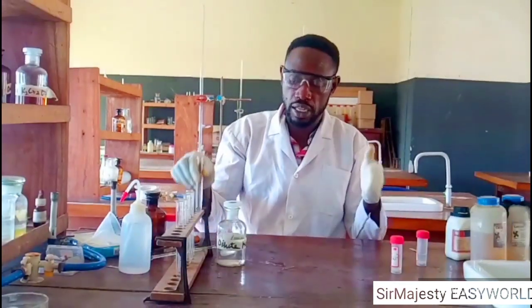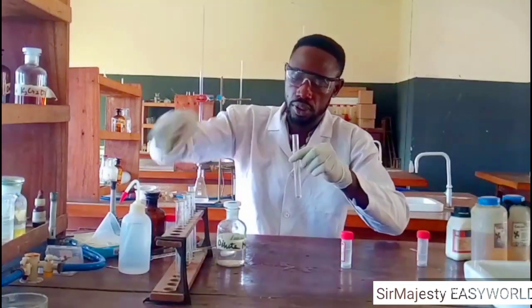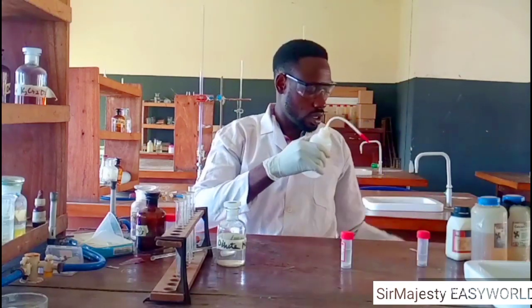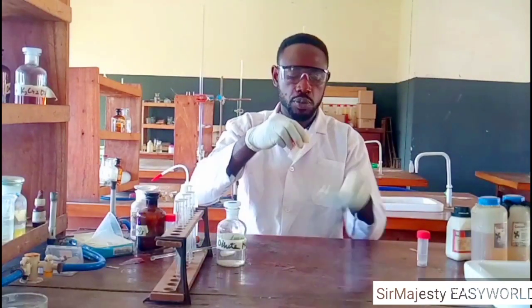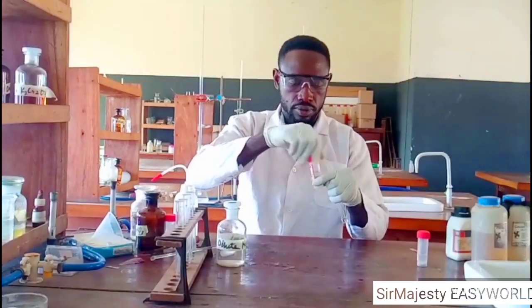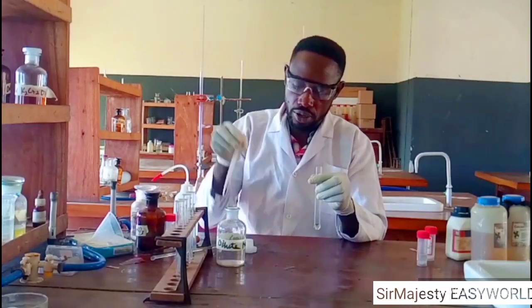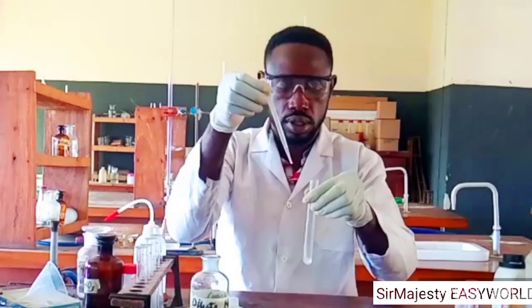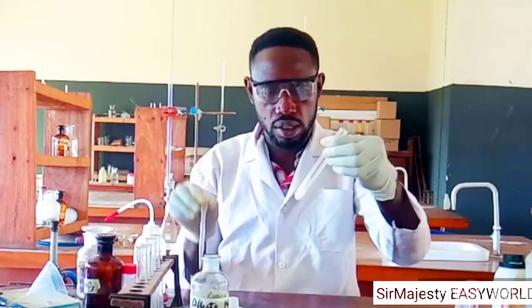Okay, let me collectively analyze them. This is E, which is calcium chloride. I'm collecting a sample of it, trying to do the same thing I did with sodium hydroxide. This is the first portion of calcium chloride. To the first portion of E, I'm adding sodium hydroxide in drops. In drops, there is a white powdery precipitate. The precipitate is also white powdery.